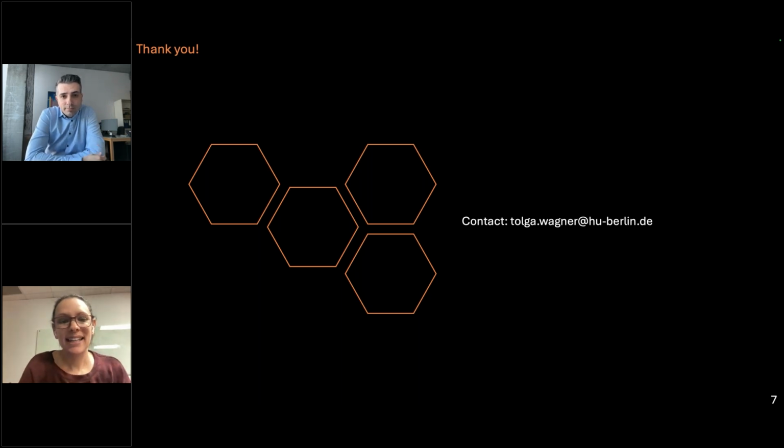Perfect. And the last question I have here for you says, what are the spatial and phase resolution limits of your holography setup? Oh, thank you. That's a very, very interesting question. I mean, the setup itself is designed, we have a very special machine at TU Berlin, to do atomic resolution, and it is rather phase sensitive. So for my experiments, it was not so necessary, because I'm looking at devices, even with the nanostructures, I have fields of view of like 200 to 500 nanometers. So the spatial resolution in general, in my case, is somewhere below 10 nanometers.